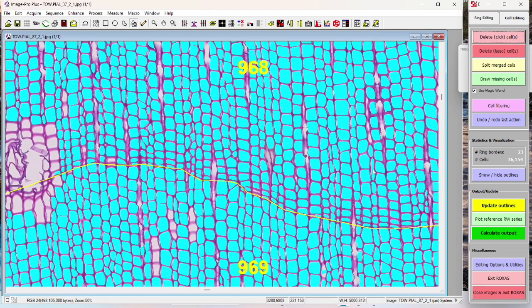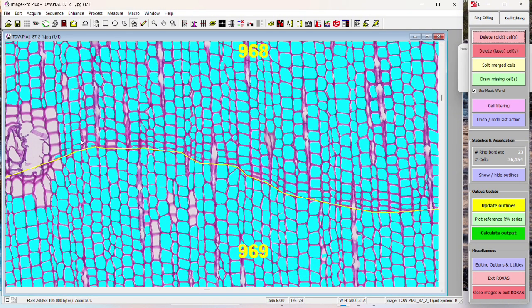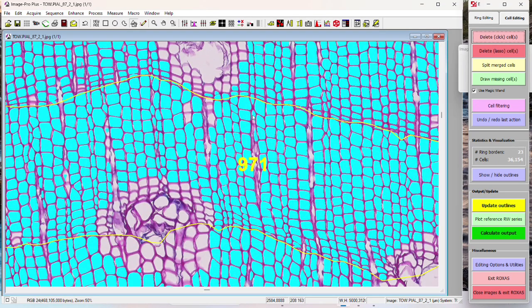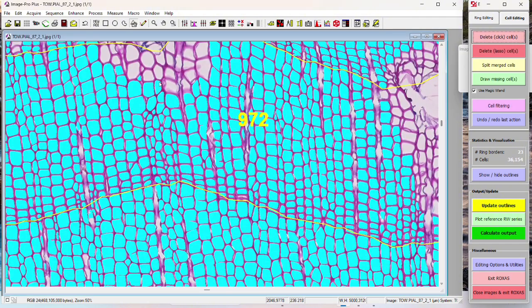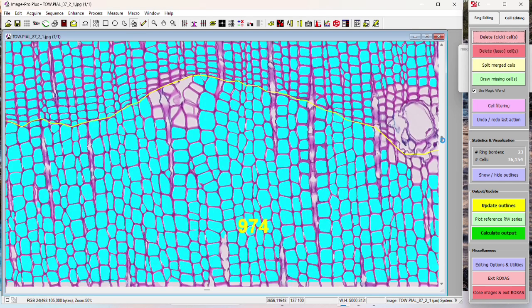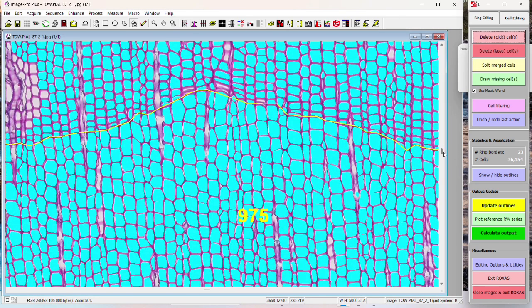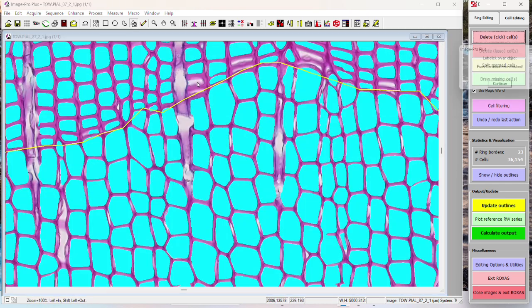It's good to go over it a couple of times to catch things that you missed previously. So this step is a really good time to do that. So I'll go all the way down through this, just looking for things, sometimes clicking unnecessarily just because I'm used to it. ROXAS AI was a really big change compared to what we used to have to do. It's still a fantastic program, but we would spend like an hour on average, between a half hour and an hour maybe, on each image, and now we don't have to do that.